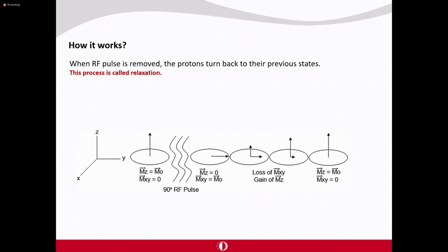That is what is meant by the 90-degree RF pulse, and this 90 degrees is usually known as the flip angle. And in imaging, for instance, from time to time, we use different flip angles, like a 60-degree flip angle, and we can flip that magnetization by only 60 degrees, but it will still create a transverse magnetization.